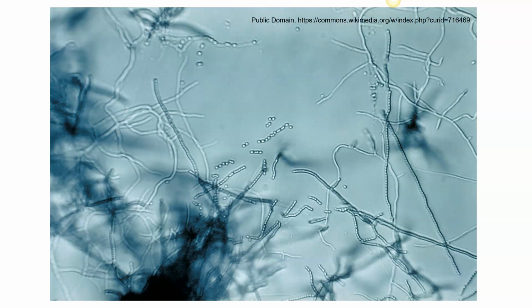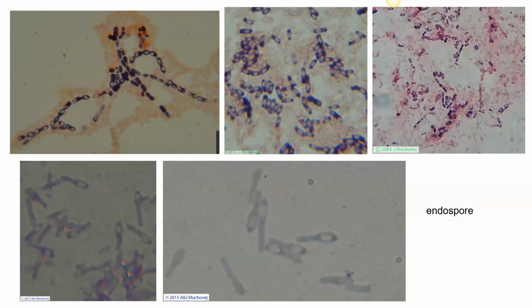When we look at bacteria, we see a lot of different kinds of things associated with them. These are all gram-positive bacteria. One of the things you see on the inside of these is it looks like they're kind of hollow. Some of them look kind of club-shaped and got this big elongate outer area, and all of those are endospores. Sometimes it's very easy to find bacteria that produce endospores. When you do, you can look at them and you can culture them like this. You can see the endospore.